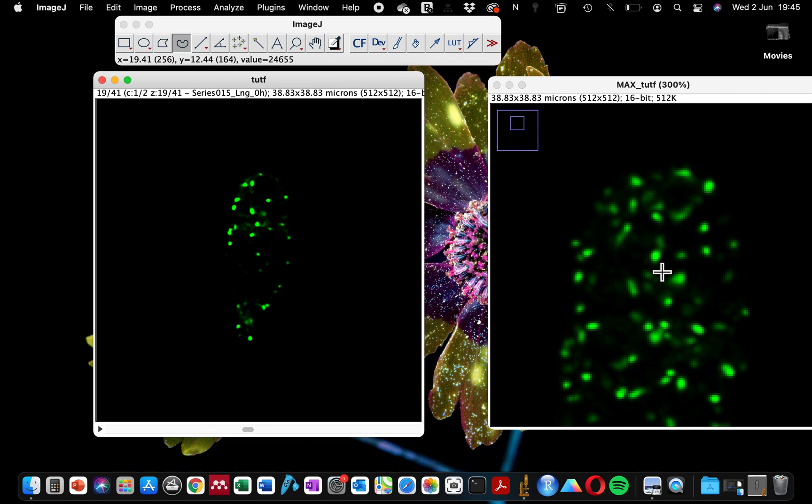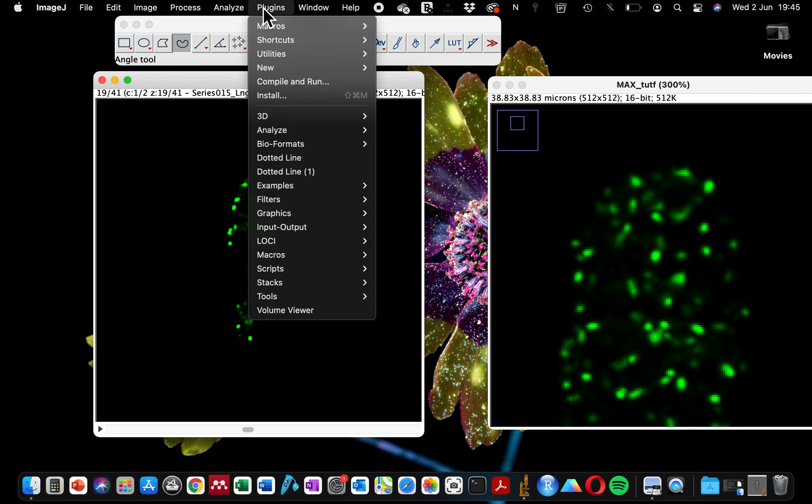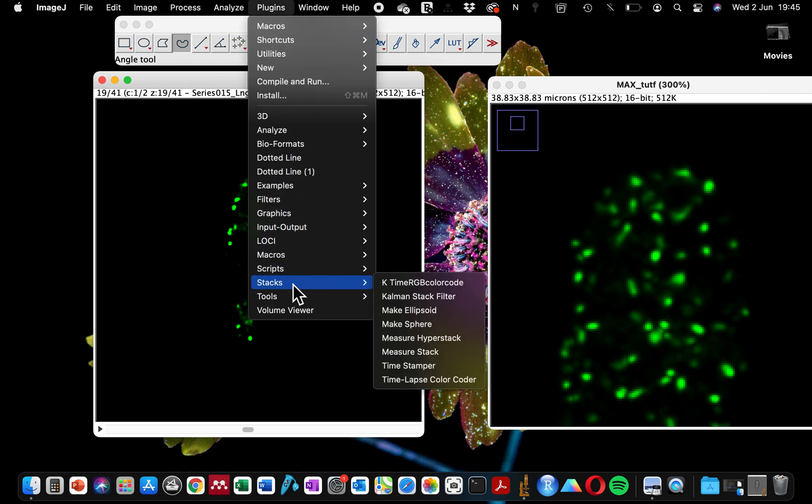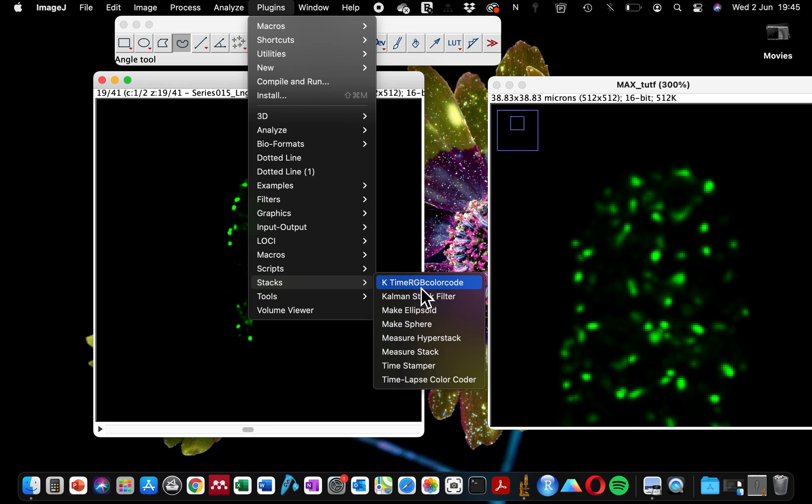What you want to do is to see the location of each of these puncta in our Z-stack. So you go to Plugins, Stacks. There are two color coding options with this plugin: you can either use this Z time RGB color code or Timelapse Color Coder.